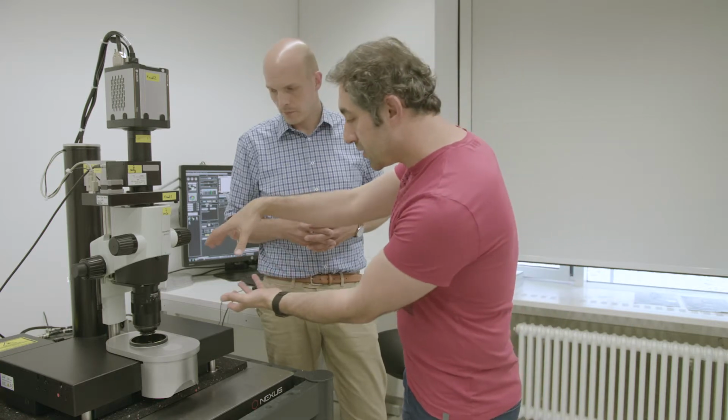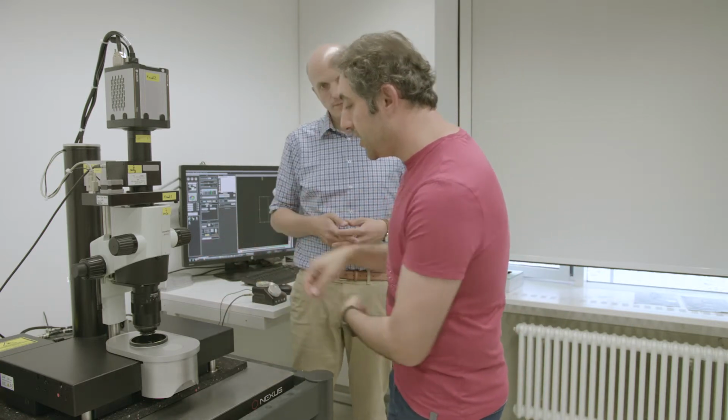And then we have, for instance, the BABB or DBE or DISCO protocols. And if we have, for instance, users running their systems with BABB or with any kind of these organic solvents, they normally have a point extraction, so a fume hood next to a funnel next to the system. This is absolutely nice and works pretty well. Okay, so that's something like a fume extractor here that eliminates the incoming molecules, let's say. That one would then be connected to the fume hoods and to the air ducts of the entire building, and then it's fine.